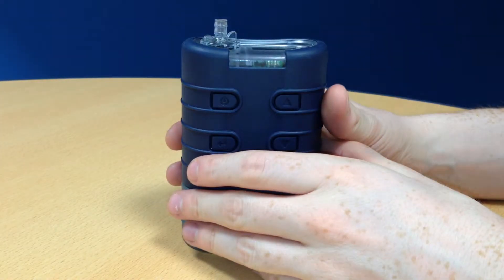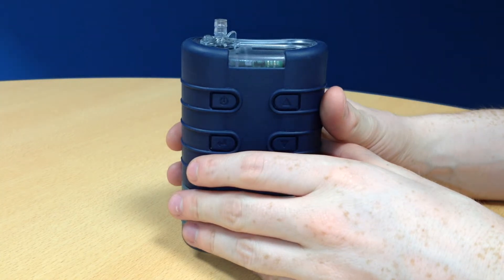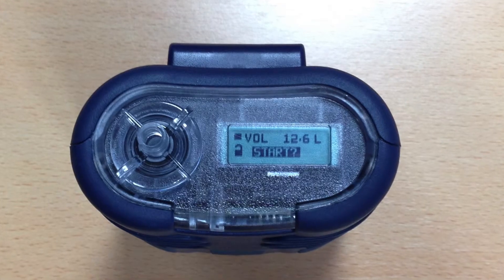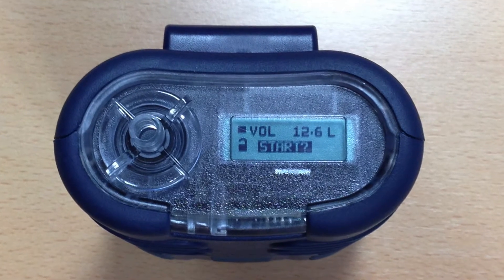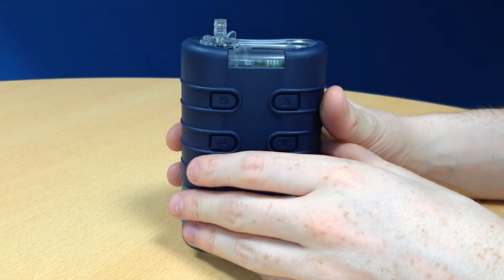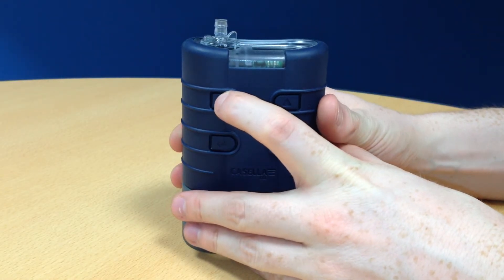To partially lock your Tough Pump, turn your pump on and then press the power button three times in quick succession. An open padlock will appear on the display if done successfully. A user can now only stop and start a measurement run. If the pump is in stop mode, you can unlock the pump by pressing the power button three times again.